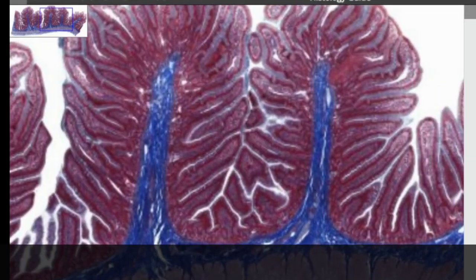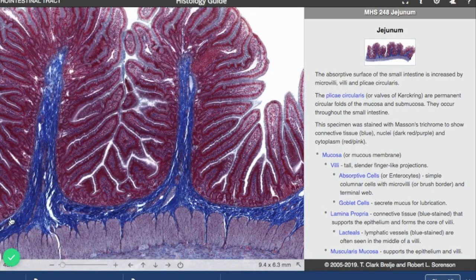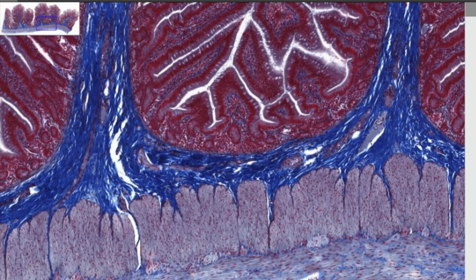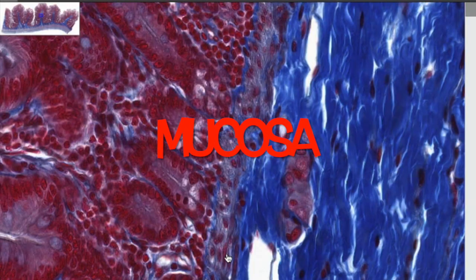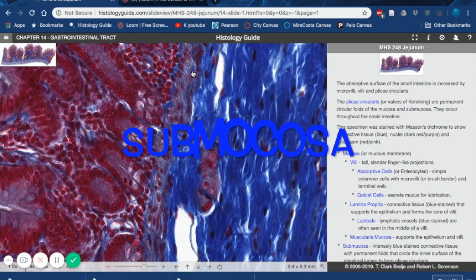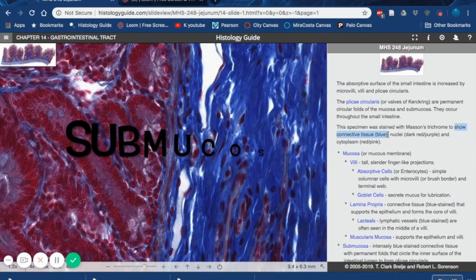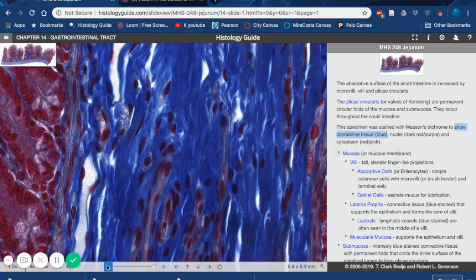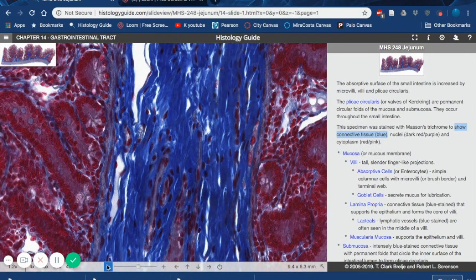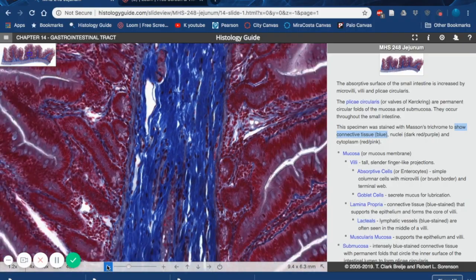The circular folds are going to contain the submucosal and mucosal layers. In this sample, the collagen of the dense irregular connective tissue that composes the submucosa is stained blue, so you're able to clearly see these layers and which layer contributes to which structure. There's a boundary between the two layers for one of those circular folds, and you can make out the thin muscularis mucosa. This staining of the dense irregular connective tissue makes it a nice sample to really visualize the different layers.